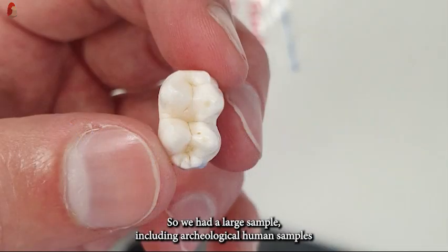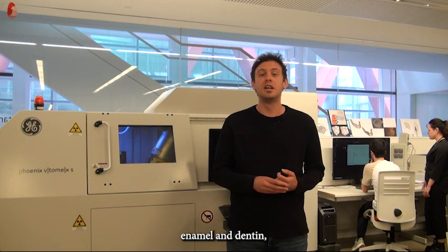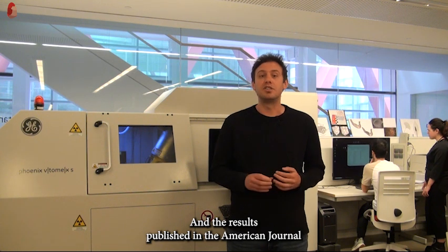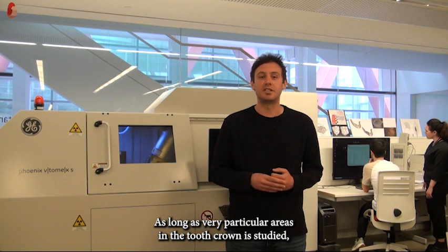So we had a large sample, including archaeological human samples, as well as clinically extracted human teeth. And the aim was to see if the variation in mineral density of these dental tissues, so enamel and dentine, is small enough that these can be used for calibrating for bone. And in the results, published in the American Journal of Biological Anthropology, we found that there is very little variation, as long as very particular areas in the tooth crown are studied.